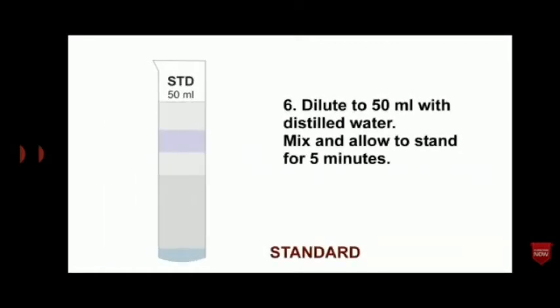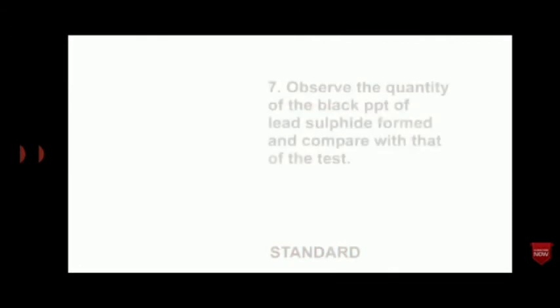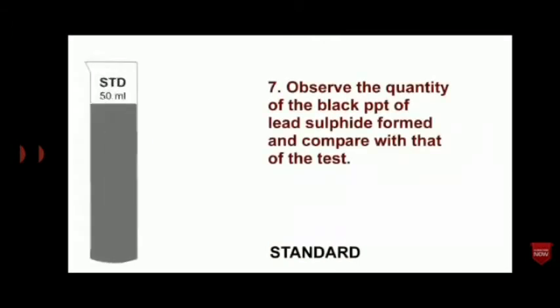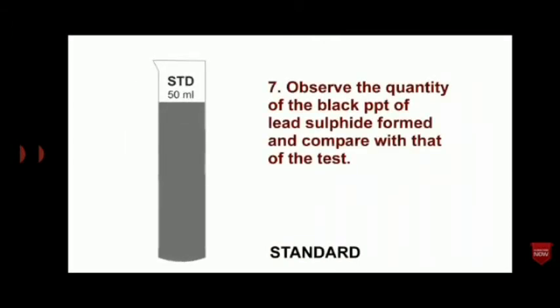Dilute to 50 ml with distilled water. Mix and allow to stand for 5 minutes. Observe the quantity of black precipitate of lead sulfide formed and compare with that of the test.